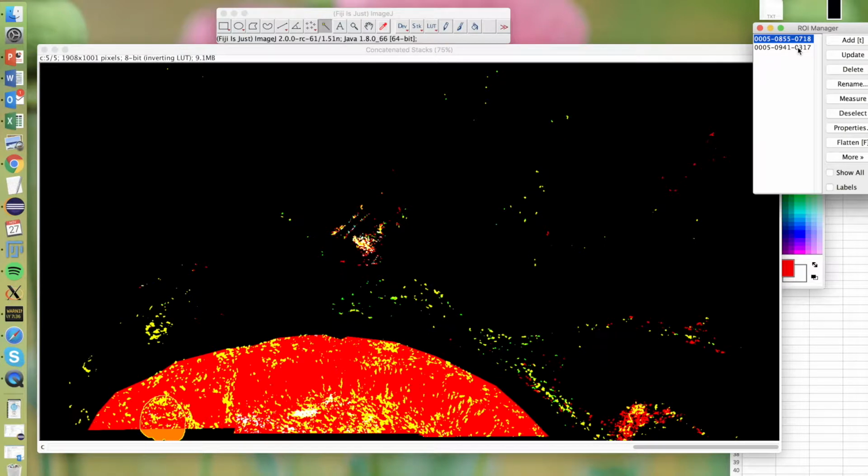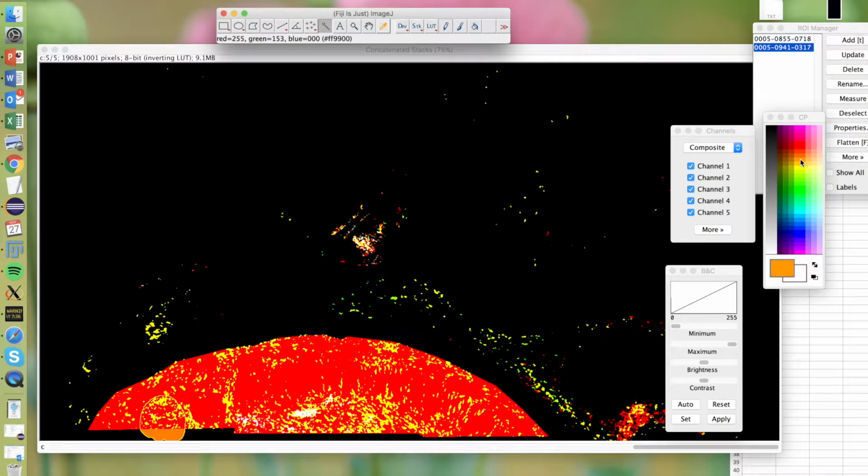We can just go back onto the shape we drew for that. There we go. Go back to orange and click it. So now we can watch up here again: the red area is 1, the orange area is 4.